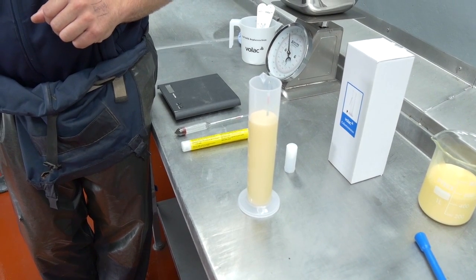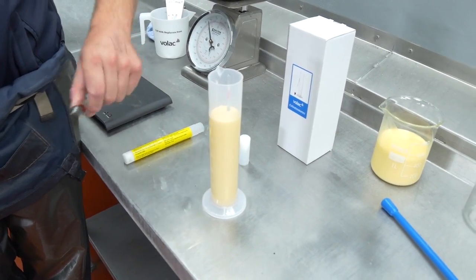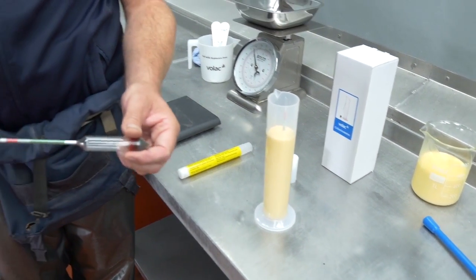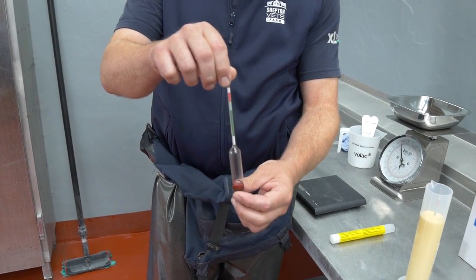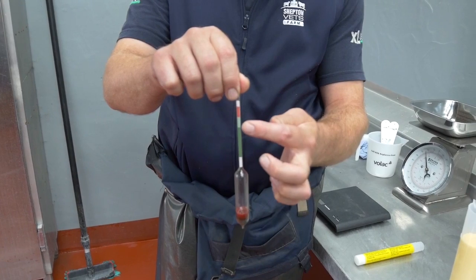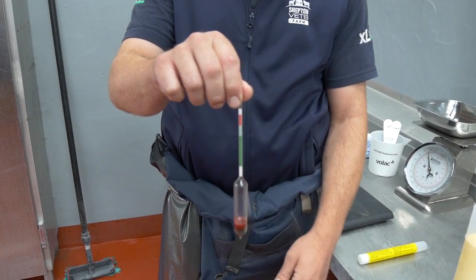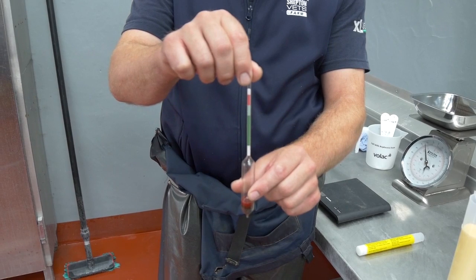You see it doesn't completely sink. If I show you one that is not covered with colostrum, this is how we interpret it. The green is good — we really want the level to be between the green levels. Anything above that means the colostrum quality is substandard.